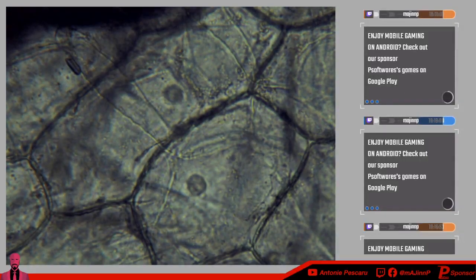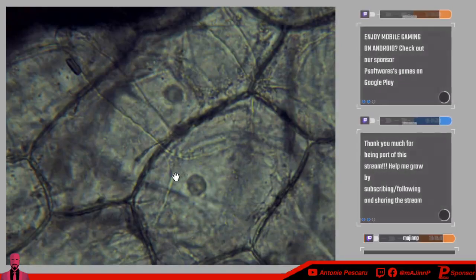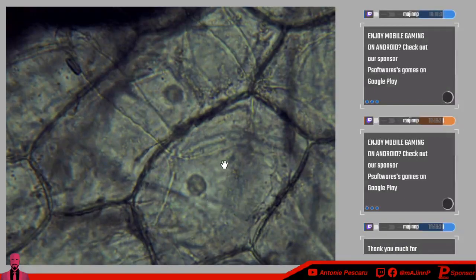It's not like we're trying to definitely spot organelles, like I said. But what happens is that it'll be way too big. It's going to see this section and we're not going to see anything. We could probably make out the cell wall, but you can make it out from here, which is definitely perfect. It's definitely a perfect view.